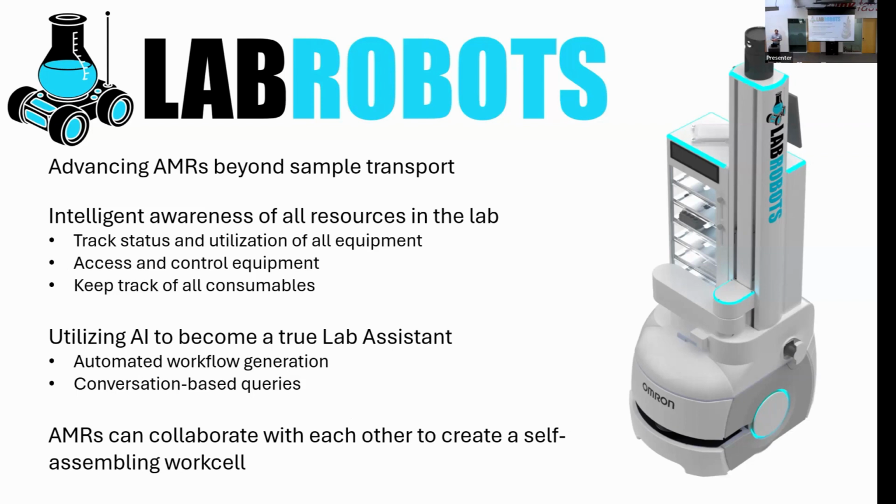We can also leverage new AI tools to make this robot really into a true laboratory assistant. By leveraging generative AI, we can automatically generate the workflow that the AMR needs to achieve based on conversation-based queries or simple setup programming, instead of requiring an engineer to think ahead and plan every single workflow and test it in advance.